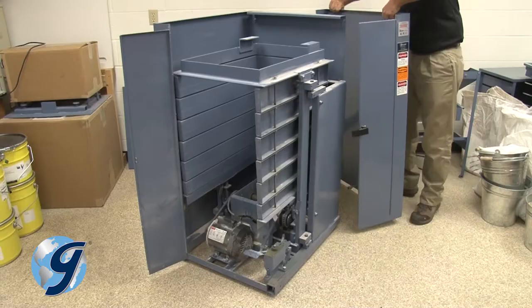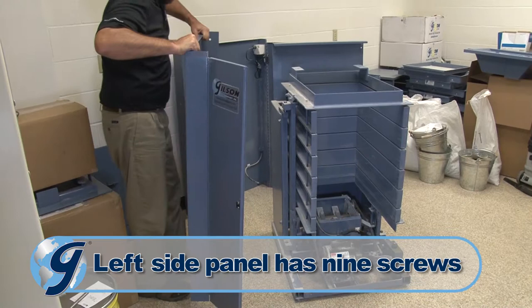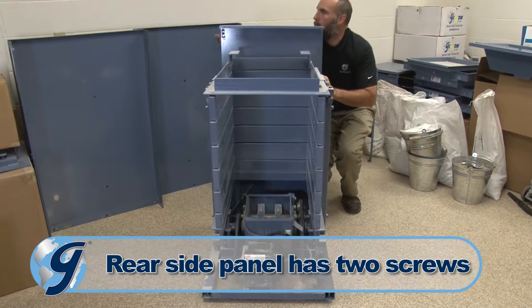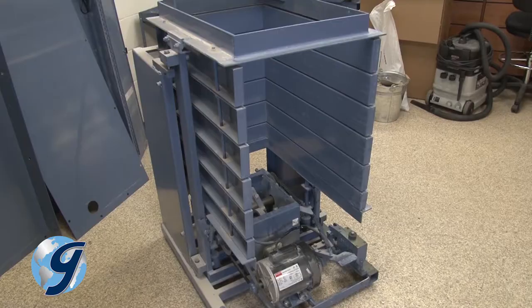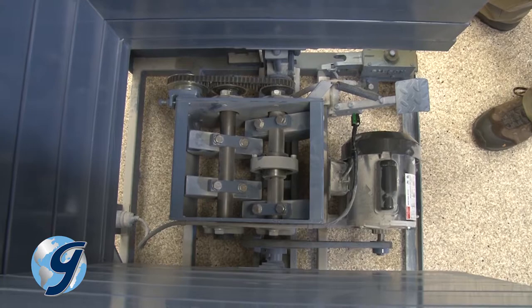Next, remove the left side panel and set it aside. Now remove the rear panel and set it aside. The components of the TestMaster are now accessible for inspection, adjustment or replacement as necessary.